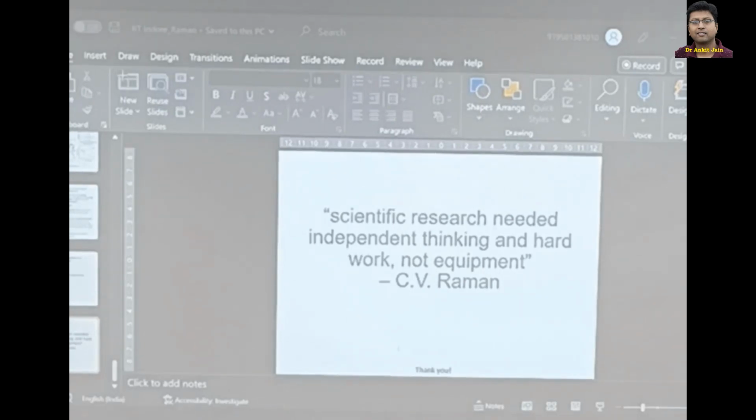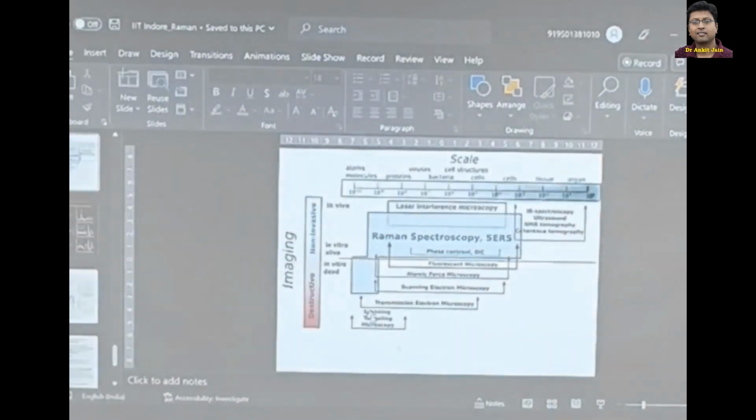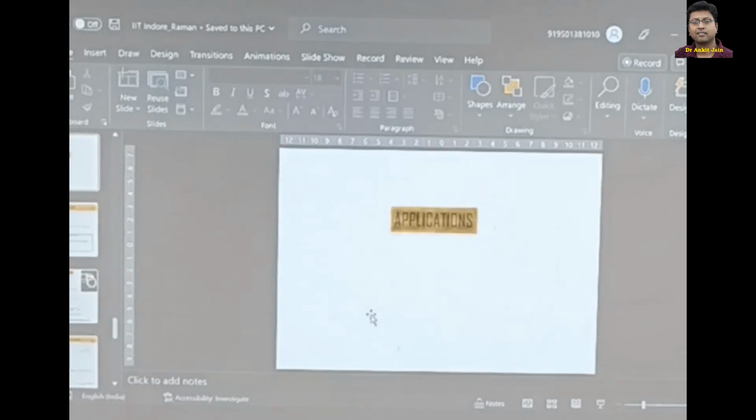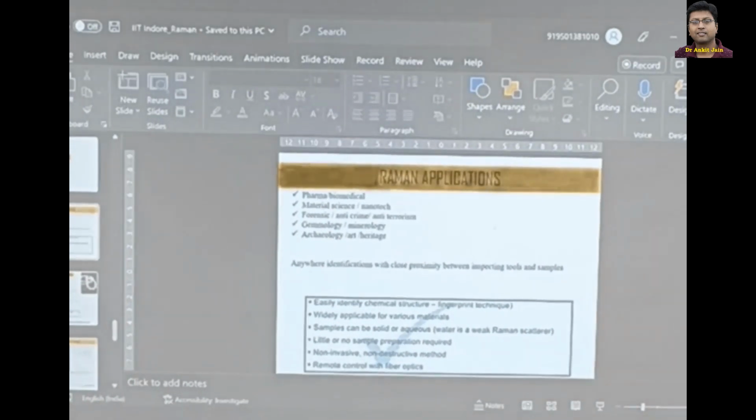Ma'am, you mentioned that in Raman we can measure the solid particles and their morphological structure and chemical composition, and you said there is no pre-treatment required for the solid particles. So if we are going for microfibers like synthetic polymeric fibers, do we need any kind of treatment if we are extracting them? How do we go for that Raman procedure?